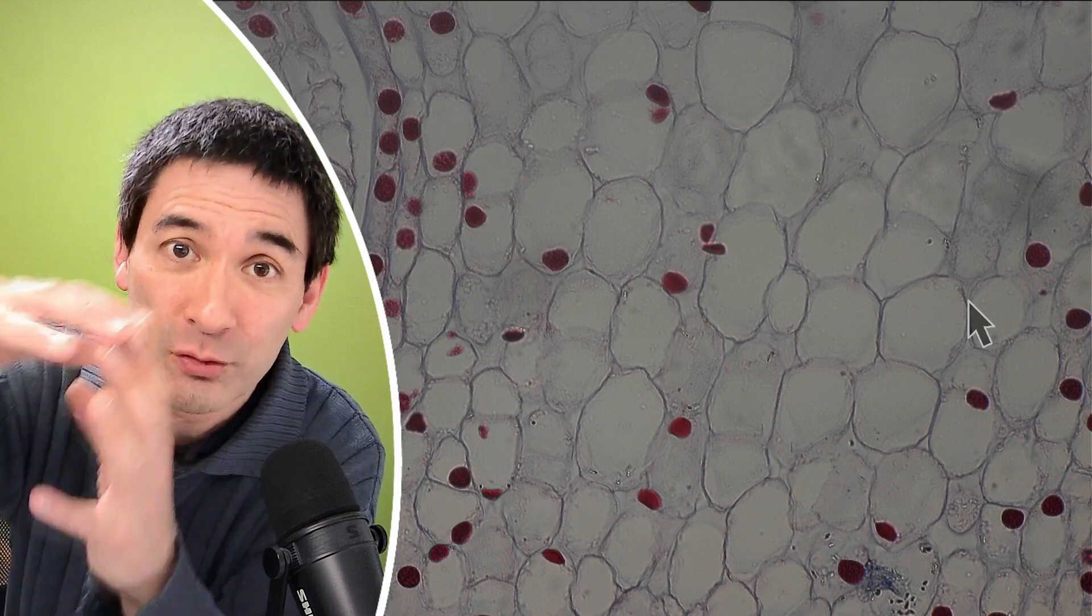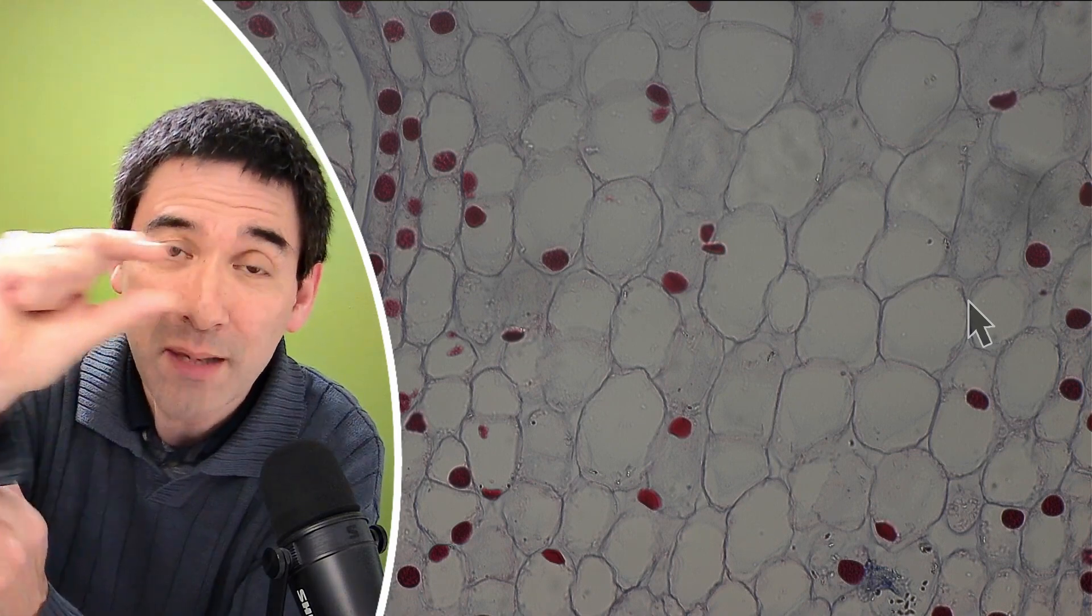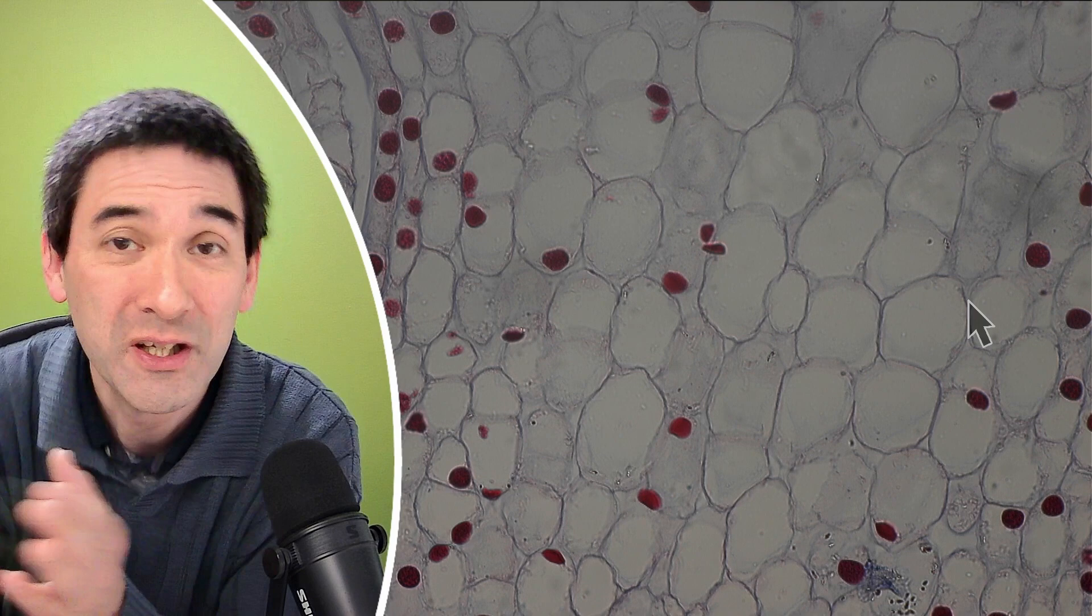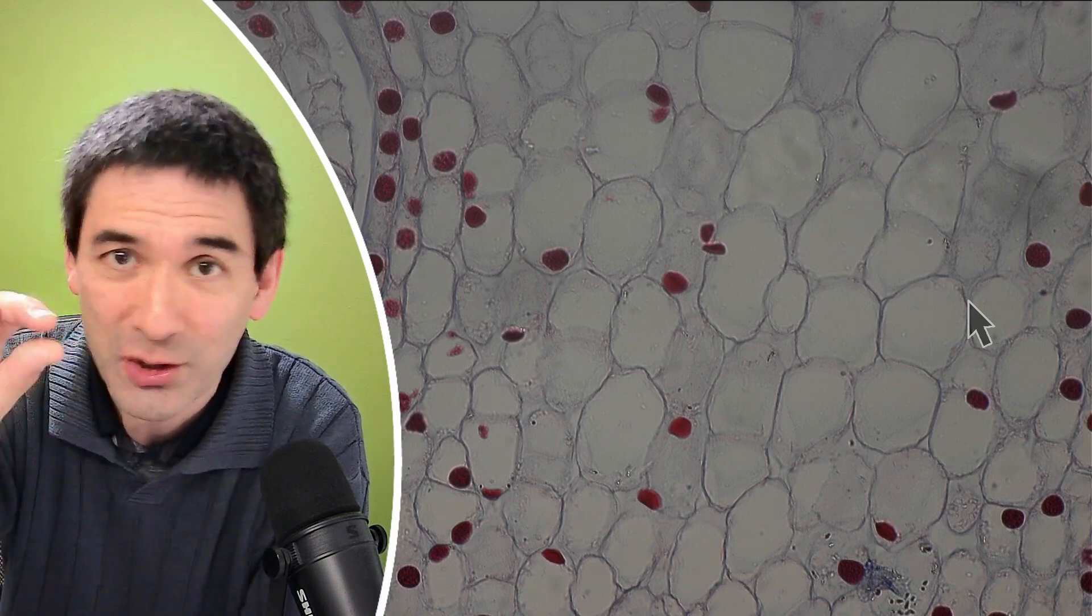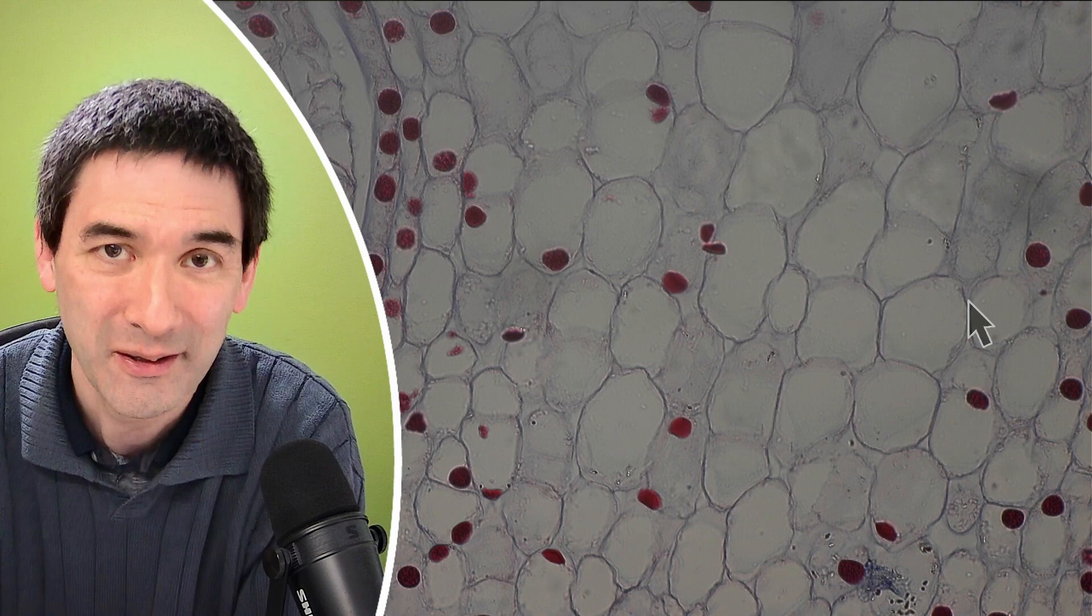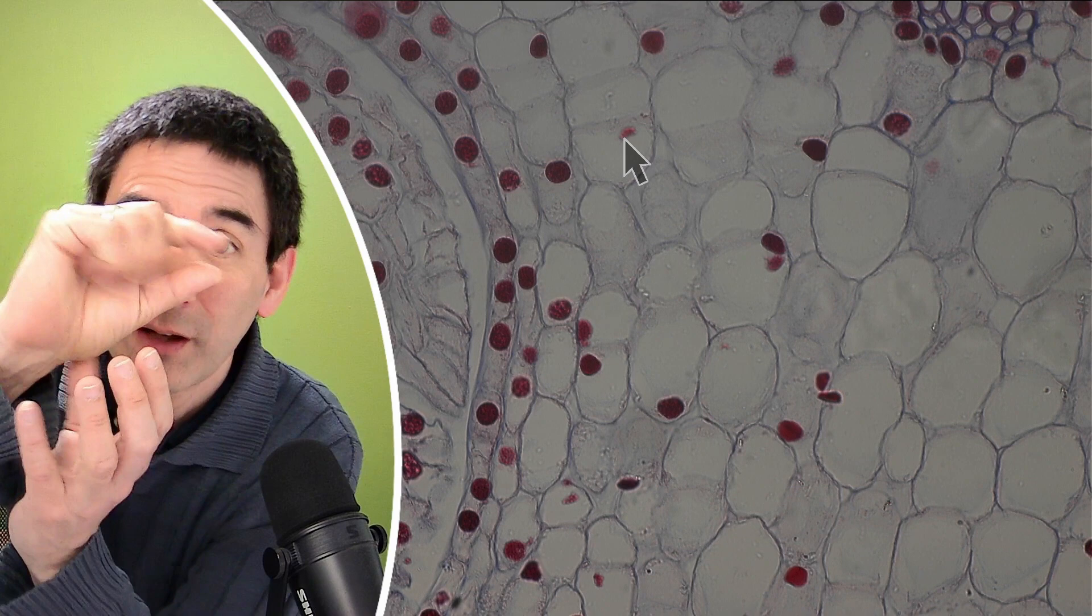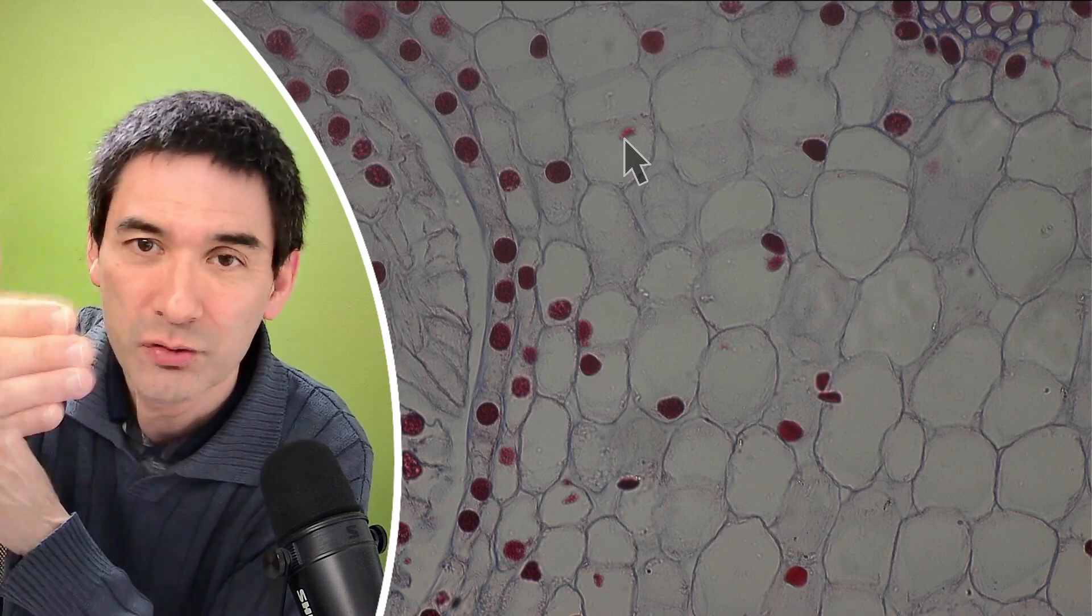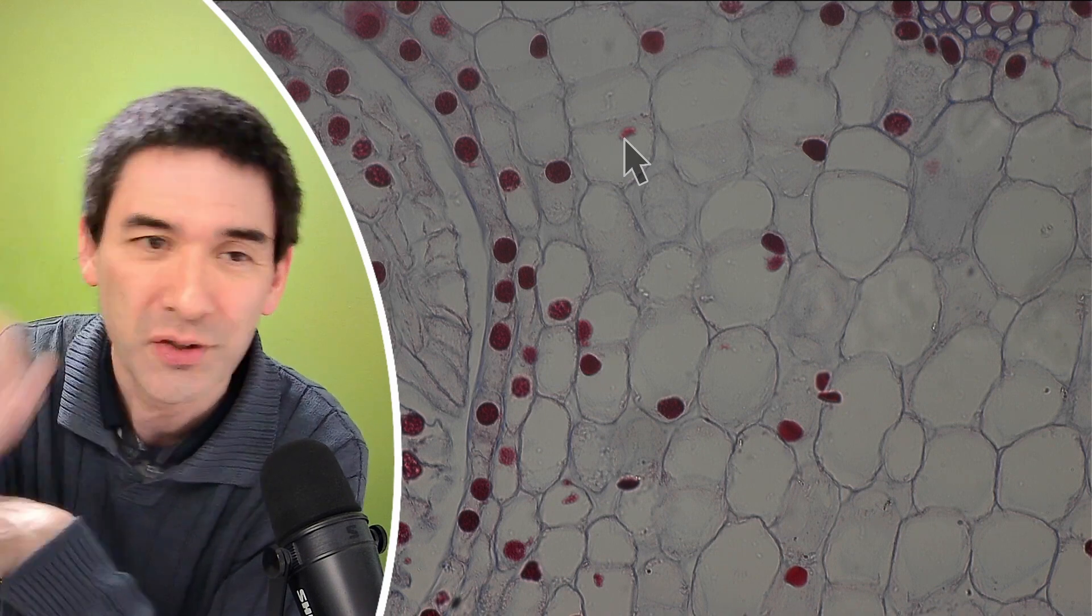They actually do have a nucleus, but we just don't see it. Because during the preparation of this specimen, the nucleus was lost. And that actually tells us already something a little bit about the three-dimensional nature of a cell. Because a cell is not flat, really, but it's actually round, a 3D structure. And now, if you basically make a cross-section of the cell, and if you cut it, and if you cut above the nucleus or below it, then, of course, you're not able to see the nucleus because you're kind of removing it and you're losing it. So this is essentially a preparation artifact. And the thinner that you make the cross-section, of course, the more likely it is that you're going to lose the nucleus this way.